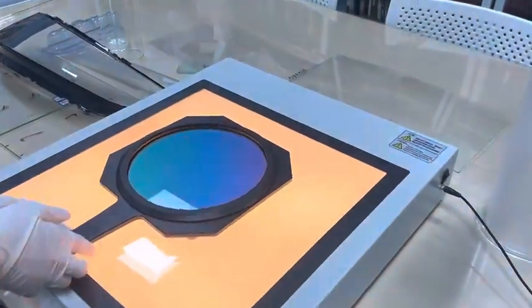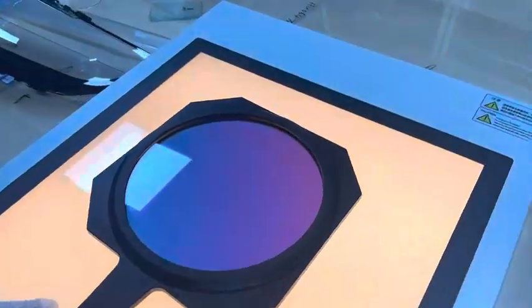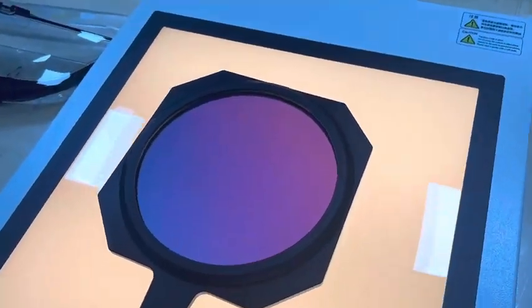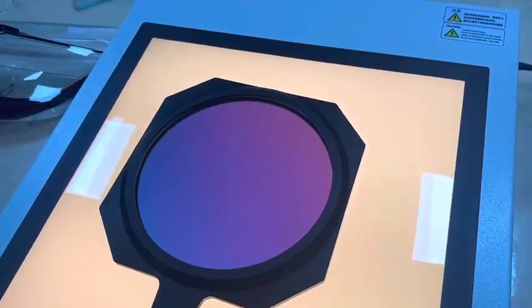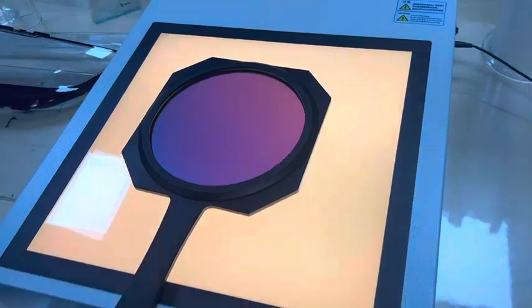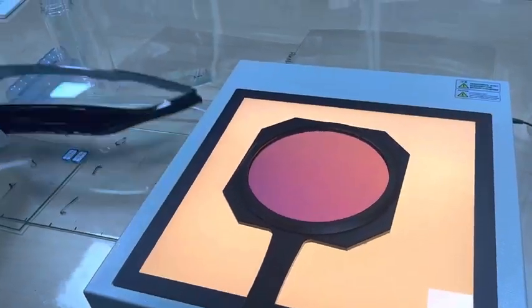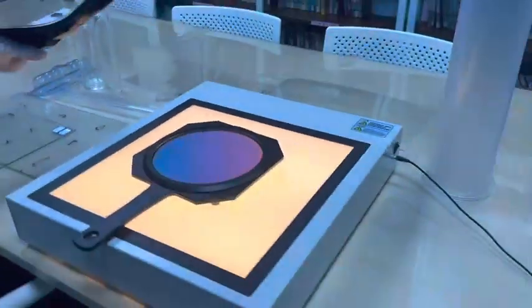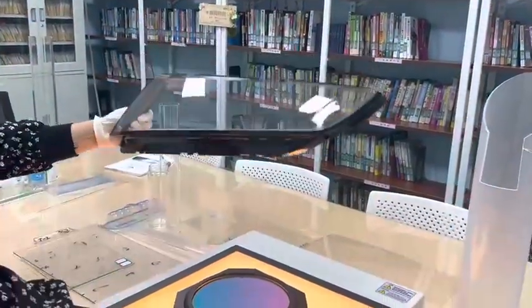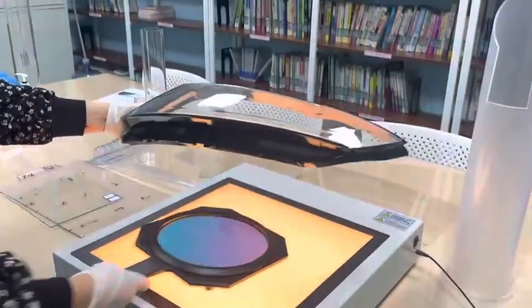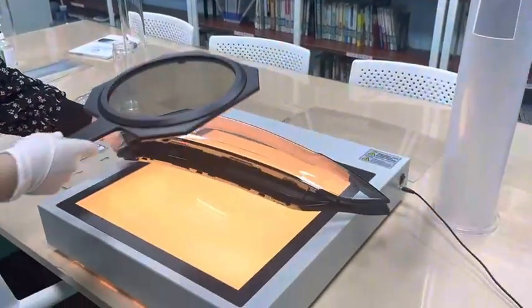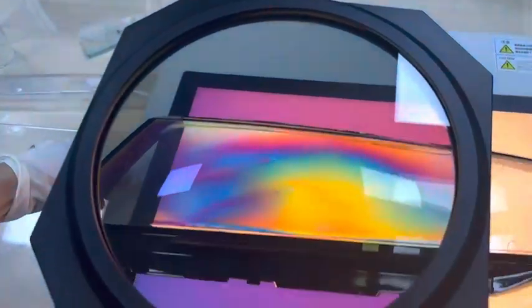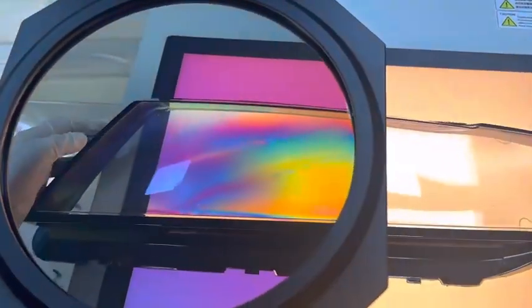Let's see the testing performance with some common samples. Lighting shield. We can check like this.